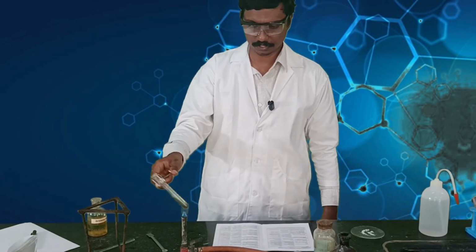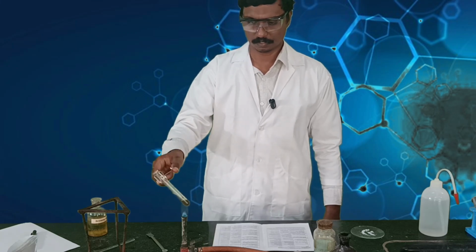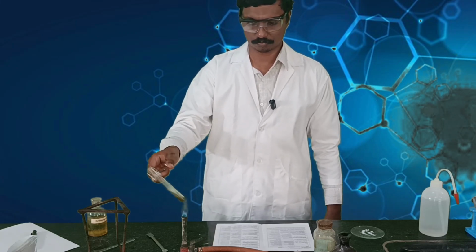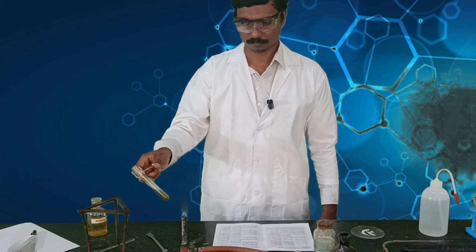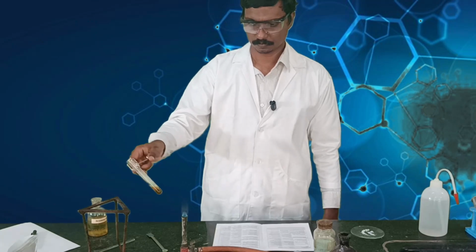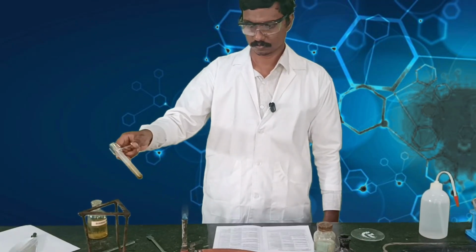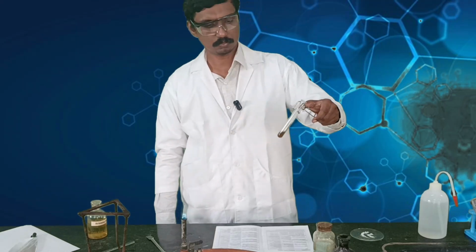Whenever you heat it, make sure that you don't hold the test tube constantly, but shake it off so that the liquid doesn't pop out. So always move the test tube. Yeah, so now it has heated well. Now you allow it to cool down for some time.